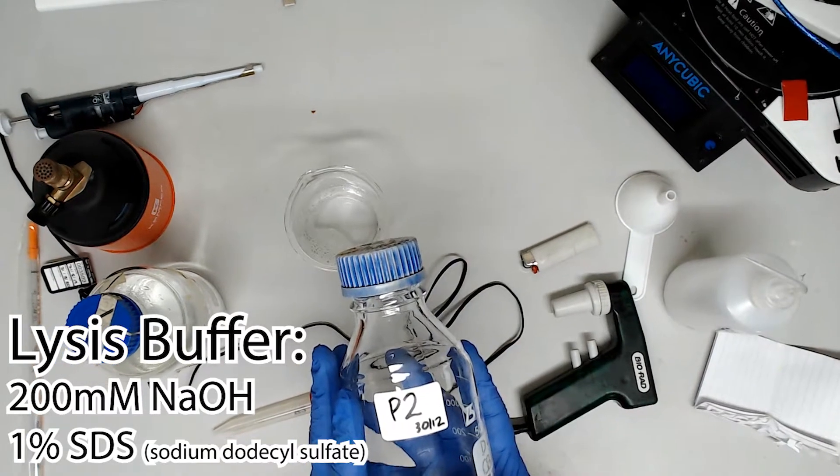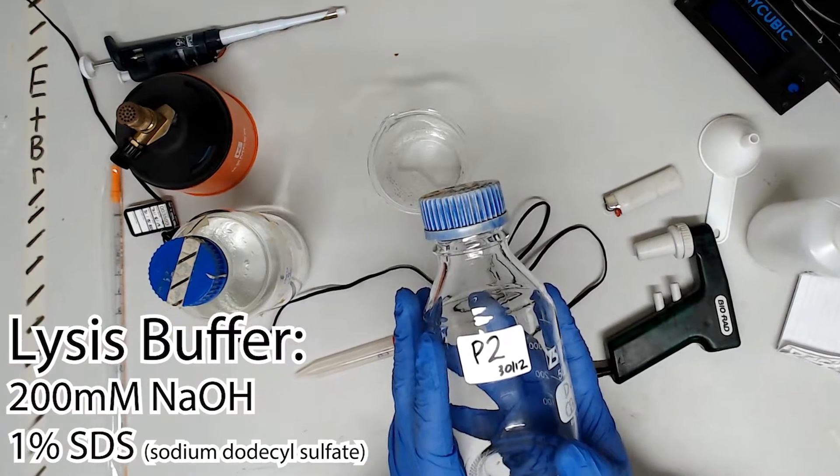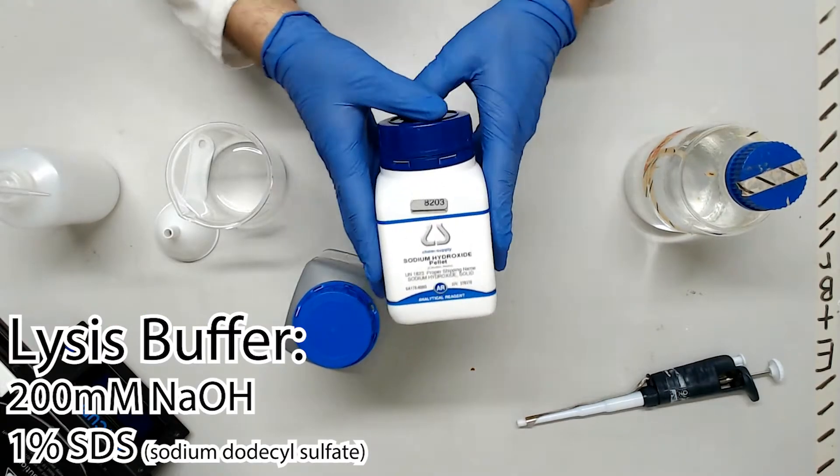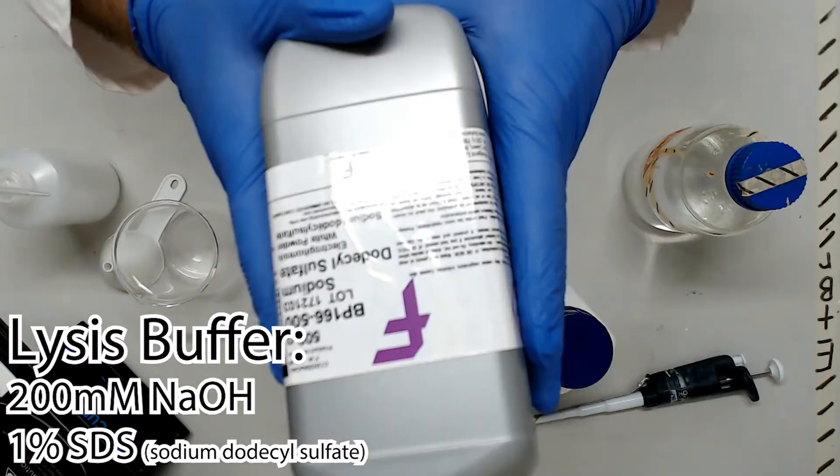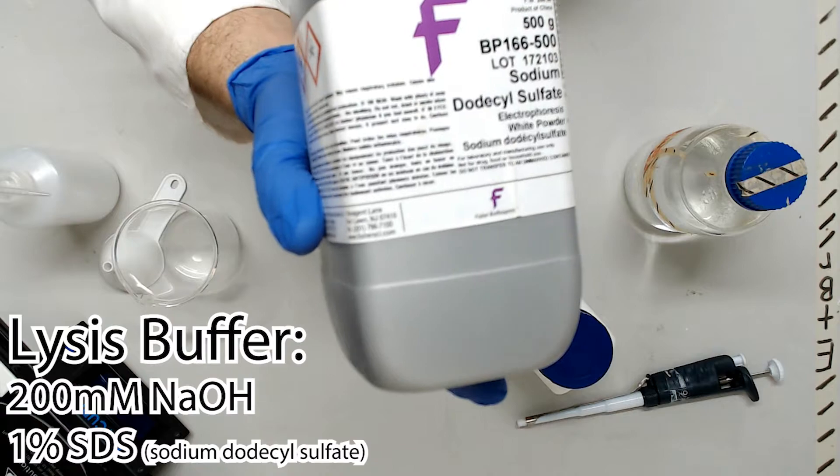The second buffer used in the mini prep process is buffer P2, also known as buffer B or lysis buffer. The role of this buffer is to use sodium hydroxide to lyse the cell while a powerful detergent named SDS solubilizes protein, lipids, and chromosomal DNA.